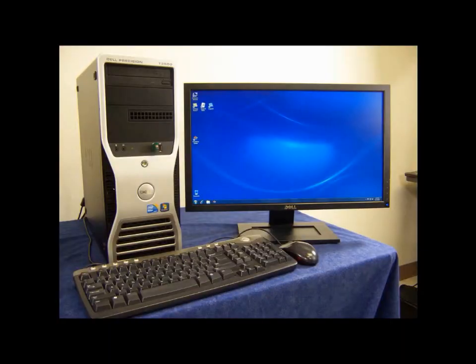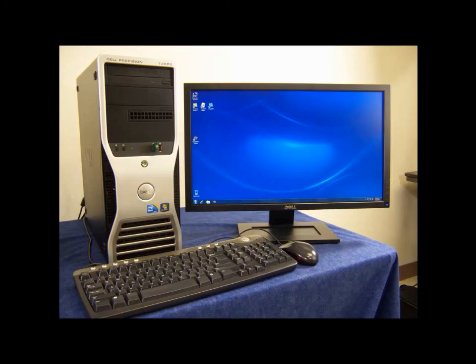The DECTAC XT system can be controlled using a Bruker supplied desktop or laptop PC. Customers can also supply their own preferred PC to work with their DECTAC XT system.